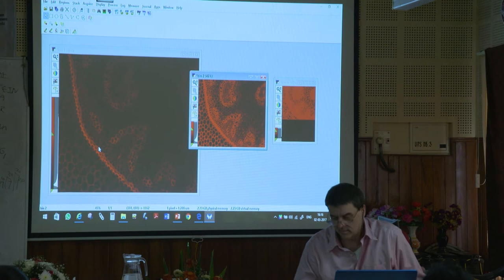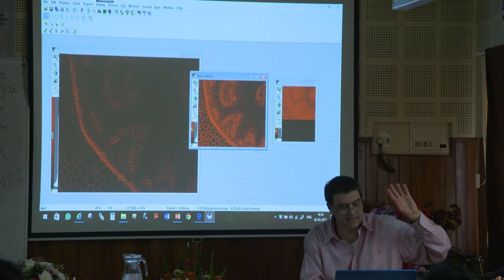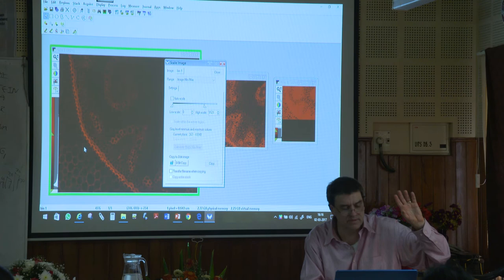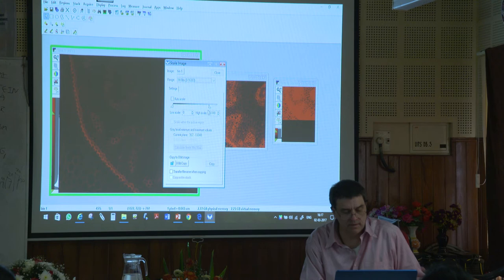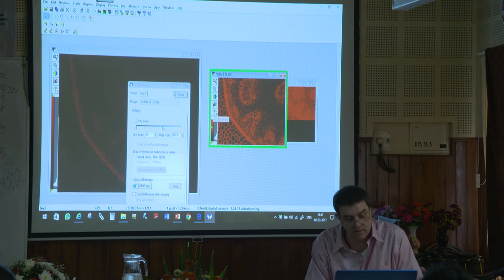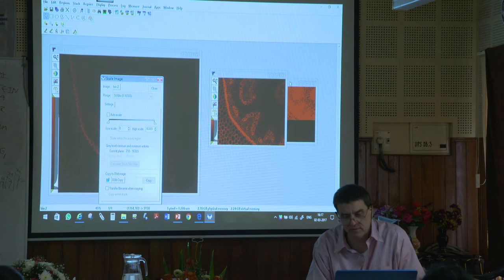Do you remember the scaling? I was talking about this axis here, right? So what I have to do is make sure that my scale for each of these images is the same. Okay, so let's say I make this image, I look at everything between 0 and 16,383, or I'm binning at 1. And then here, I'd have to make those numbers the same, right? Remember, to make it fair. So now this one's scaled at 0 to 16,383. And then to be fair, I'd have to do this one at the same thing. Okay?